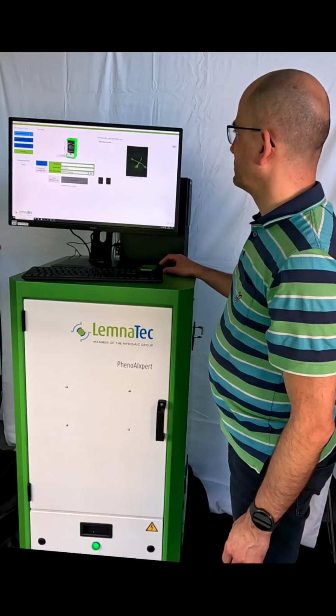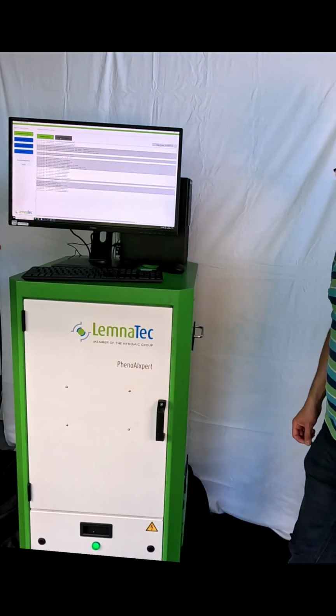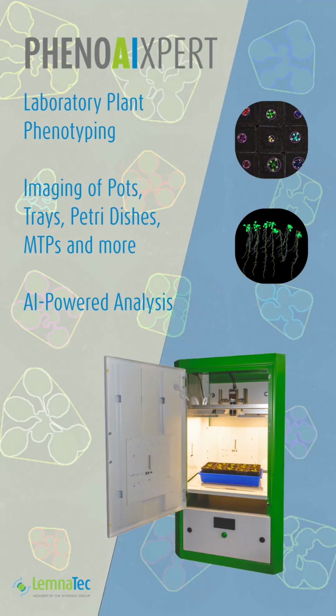When you have finished imaging, navigate to the Initialize Shutdown tab and shut down the software. Then you can also switch off the cabinet and the computer. LemnaTec PhenoAIxpert, a laboratory plant phenotyping system for imaging and image analysis.